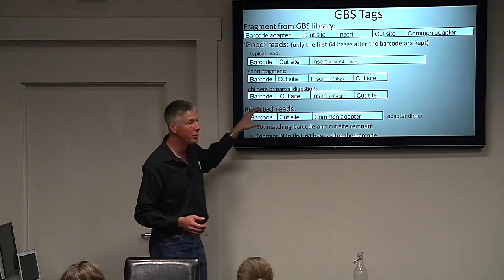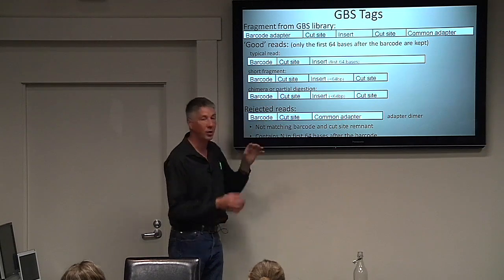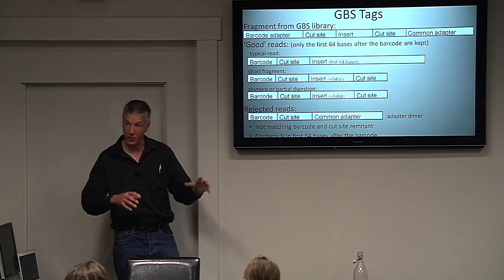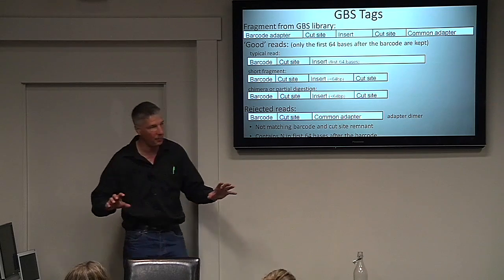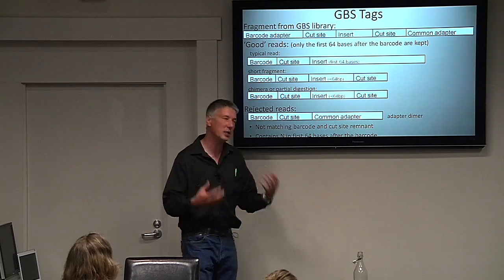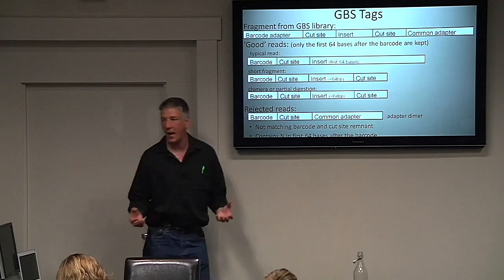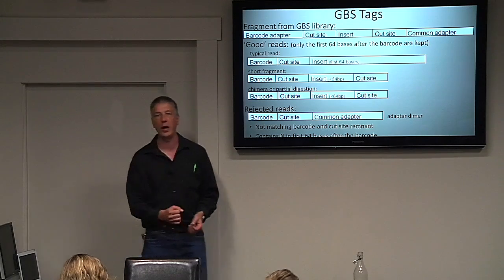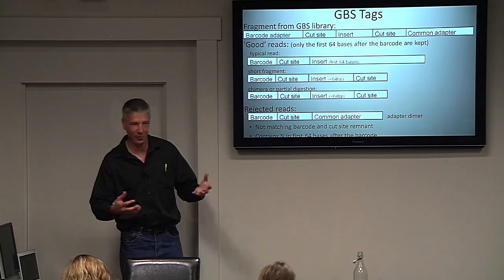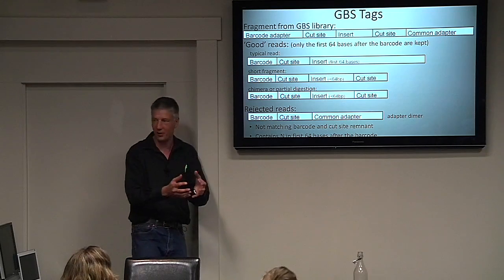When you do a digest, you're cutting the DNA up, right? Which is what we do. And if you remember from this morning, we do the digest. We cut the DNA up with a restriction enzyme. It has these sticky ends. It's in this well that has the adapters in them, right? And then we put some ligase in there. And the ligase just joins things back up, right? That's what it does. It's pretty simple. You cut it up and you put it back together again.